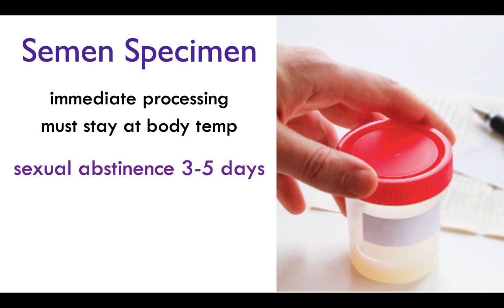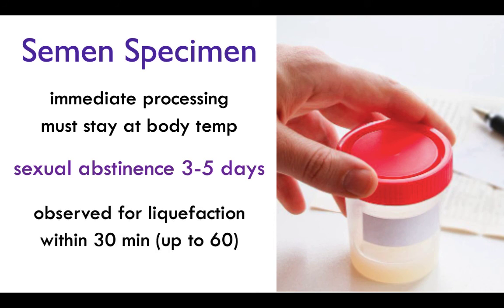It's recommended that the person donating the sample is sexually abstinent for 3 to 5 days prior. Because that sample needs to get there really quickly, one of the reasons we need that so fast is because we're looking for liquefaction. Typically, shortly after ejaculation, the semen will coagulate.